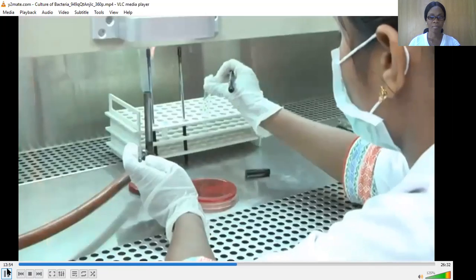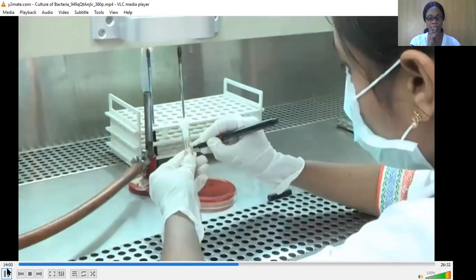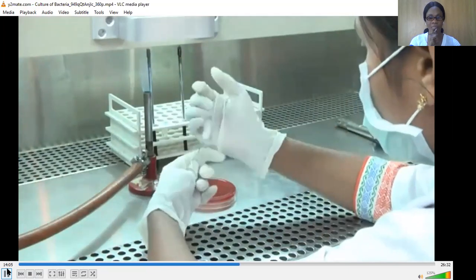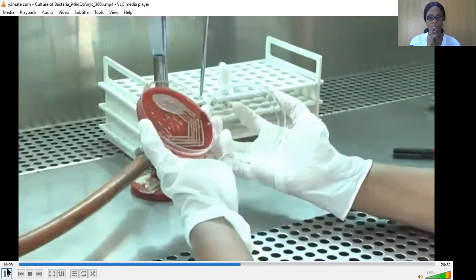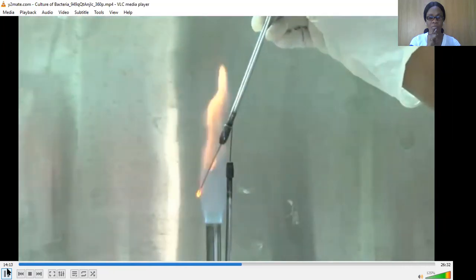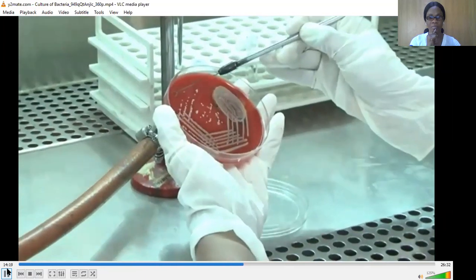Take any suitable sterile liquid medium like peptone water, BHI broth, etc. and label it before inoculation. Loosen the plug or cap. Keep the specimen or culture plate from which a colony has to be inoculated ready. Sterilize your inoculating loop and allow it to cool down. Remove the lid of the culture plate and pick an isolated colony.